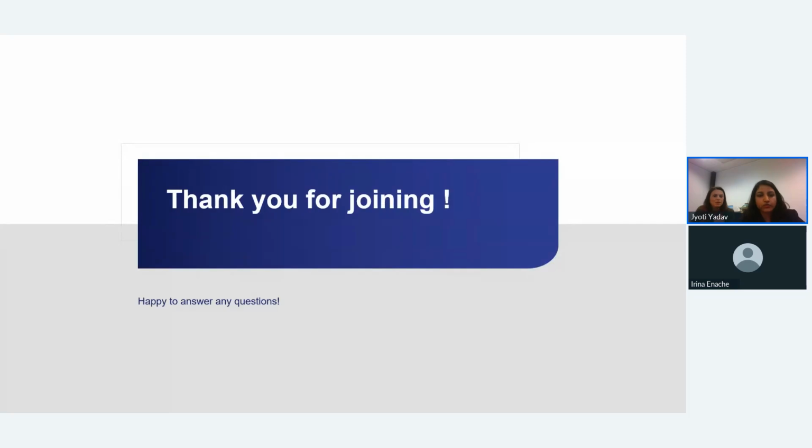So thank you all for joining. If you have any questions, we are happy to answer. Yes, thank you very much for joining us today. Jyoti has shared with you some background information about kinetics, induction time measurements and nucleation. Also how you should prepare your samples, how to use the Crystal16 software, how to export your data and how to analyze it.